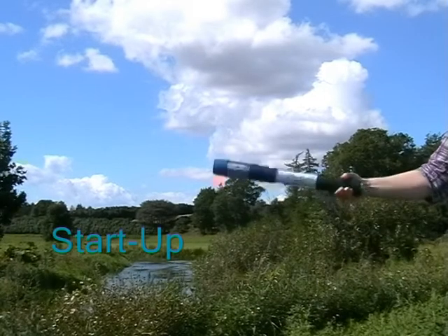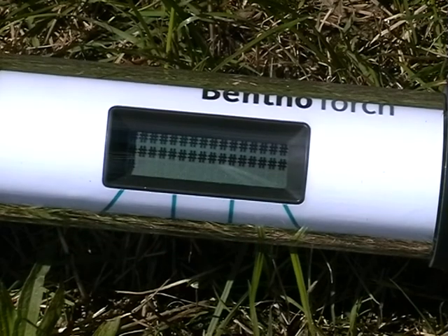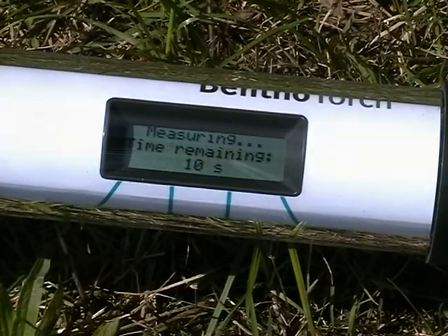The instrument is turned on as shown. To start the measurement, simply press the keys menu and then OK on the side of the instrument. The display shows the countdown to the initiation of the LEDs and then the seconds remaining until the end of the measurement.